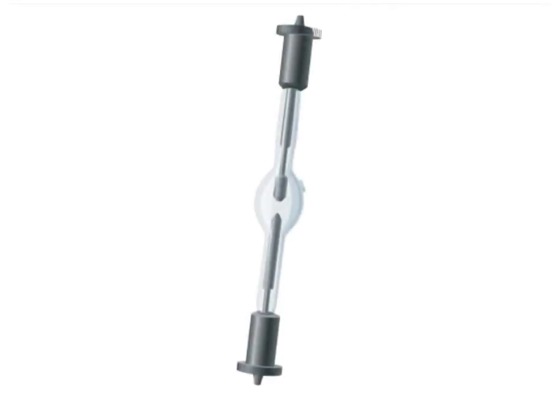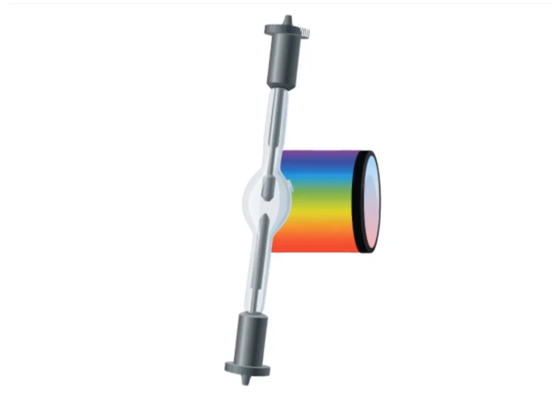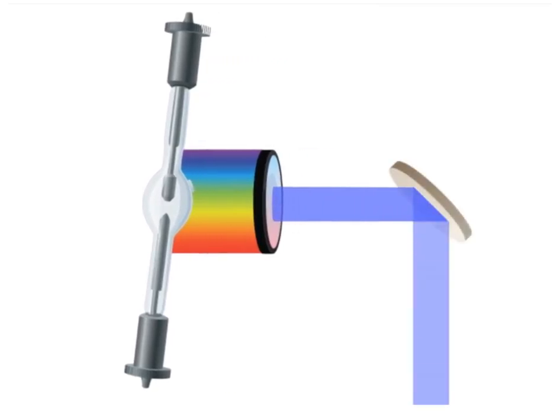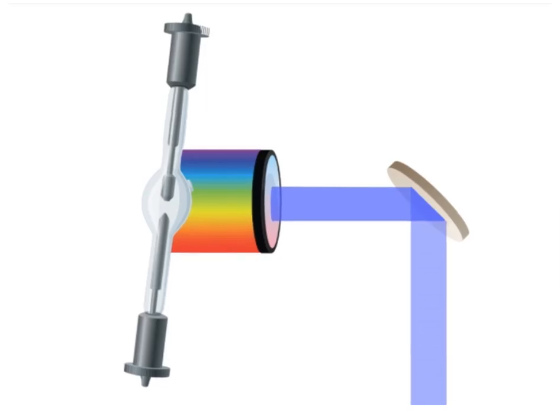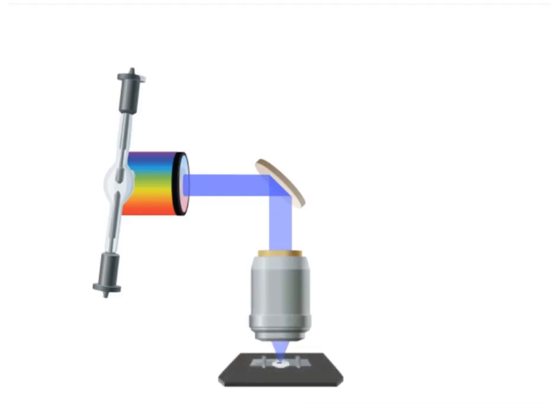The principle behind fluorescence microscopy is simple. As light leaves the arc lamp, it is directed through an exciter filter, which selects the excitation wavelength. This light is reflected toward the sample by a special mirror called a dichroic mirror, which is designed to reflect light only at the excitation wavelength. The reflected light passes through the objective where it is focused onto the fluorescent specimen.